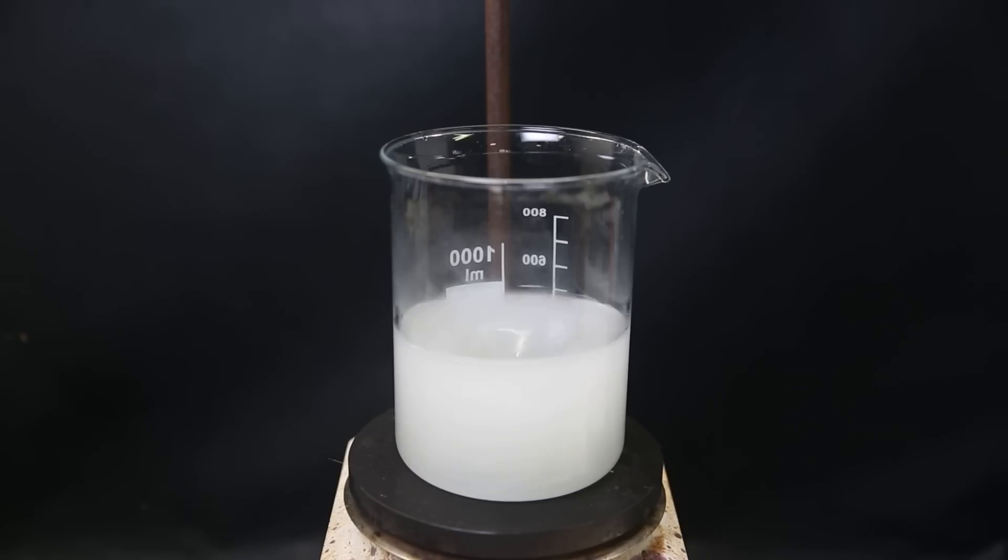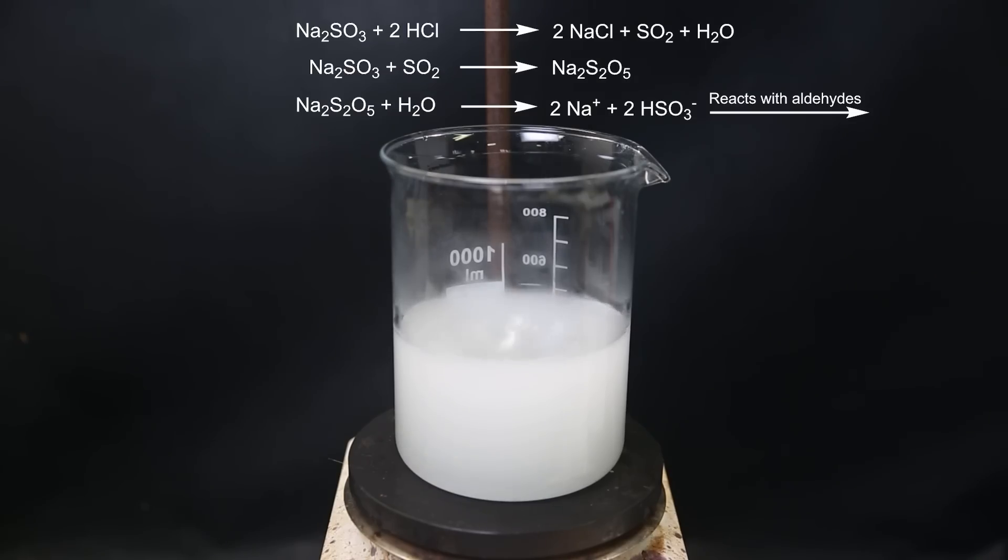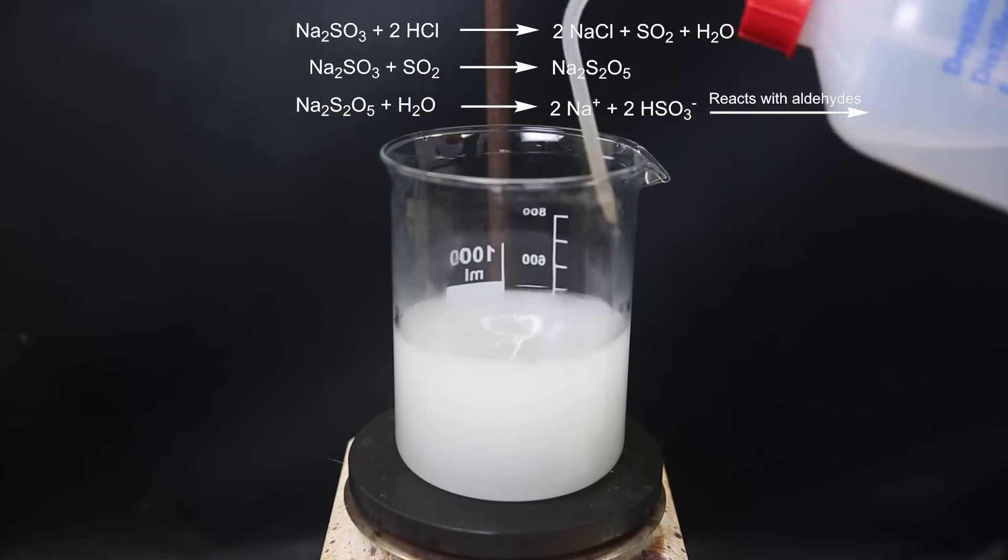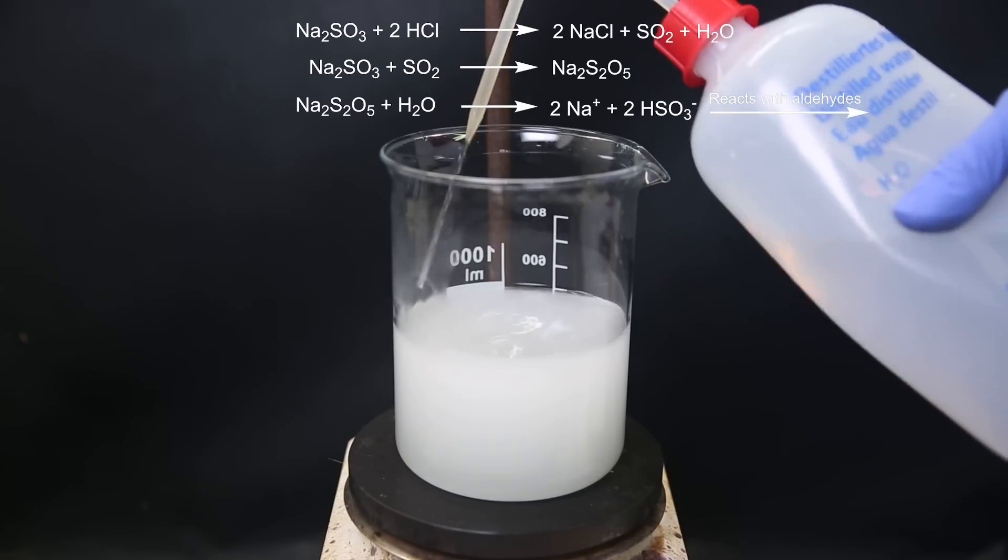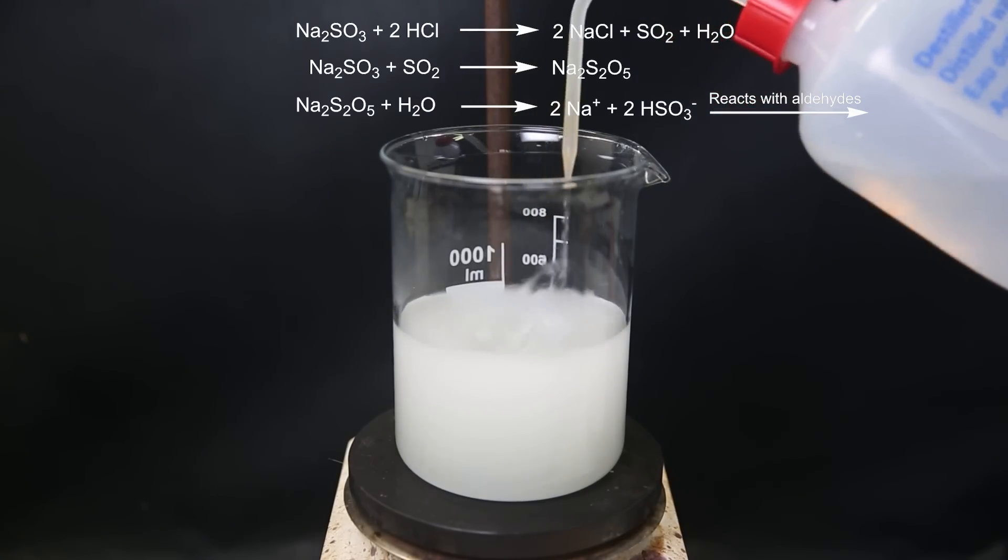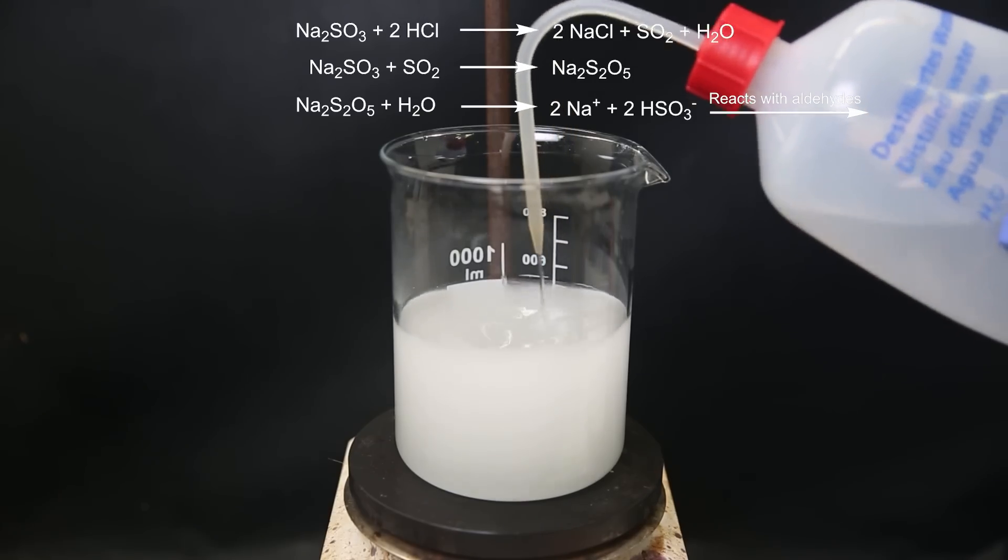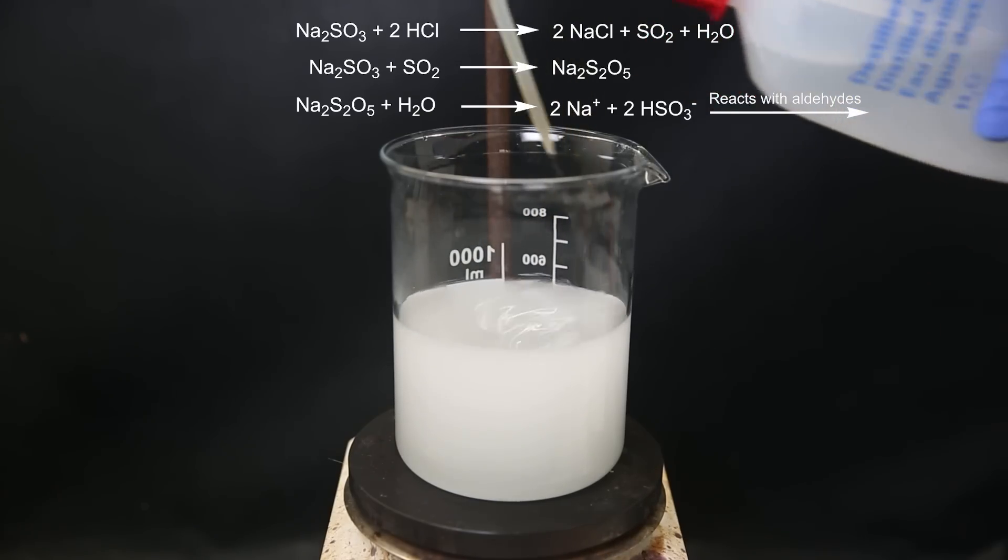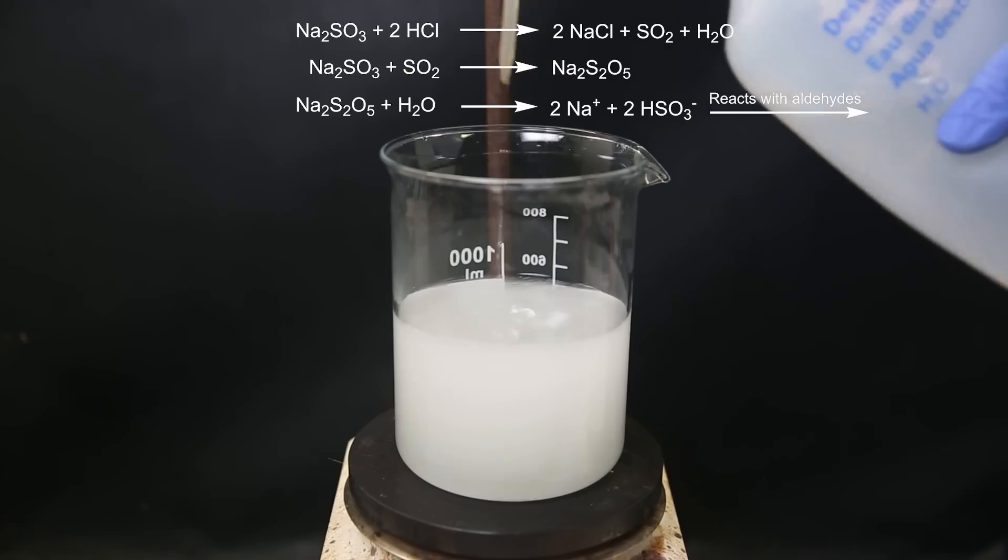One possibility why acid might be a problem is because the acid reacts with sodium sulfite to form sulfur dioxide. Sulfur dioxide then reacts with sodium sulfite to form sodium metabisulfide, which in solution forms sodium bisulfite, which can react with the benzaldehyde to form a complex that stays in the water layer and thus can't be extracted.